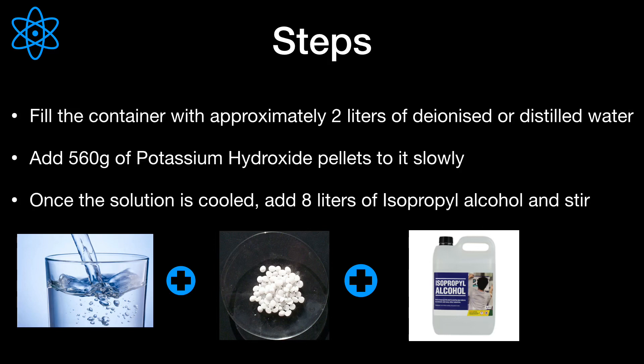Then, to the DI water, add 560 grams of potassium hydroxide pellets slowly. Do not add the pellets all at once, as potassium hydroxide dissolving in water is exothermic and could overheat the solution.